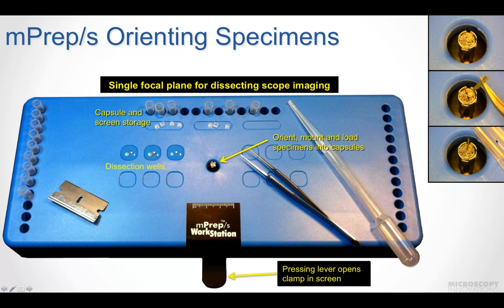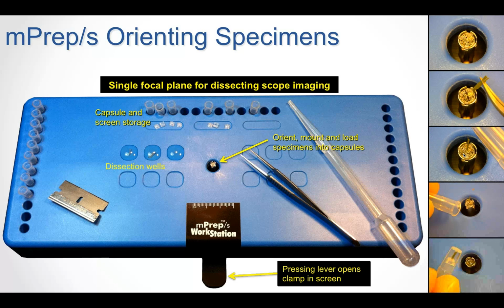The capsule is simply dropped over the insertion tool, rotated slightly counterclockwise, and lifted off. And we see the specimen is now loaded into the capsule, being pinched in by the screen. After the samples are loaded, they are placed over on the sides over here in these wells that can retain fluid, either on this side or on this side here.